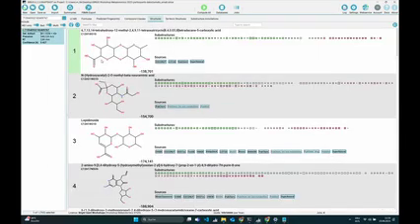And if we look at this and look at the structure tab, if we just look at the squares a little bit, we can see, okay, we have a lot of red squares. Also, the confidence is not very high, 0.4 is not a high confidence score. And if we right-click on this, highlight matching substructures, also some parts don't really seem to match.